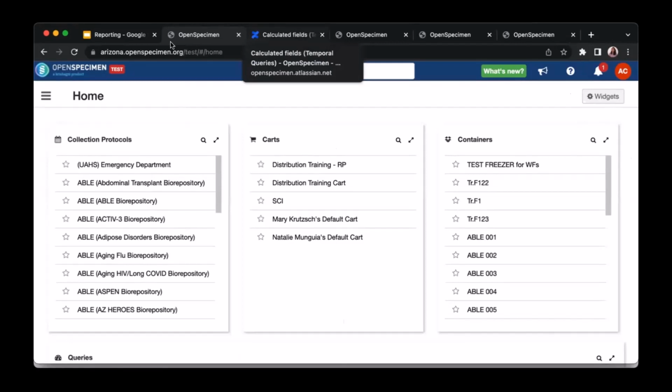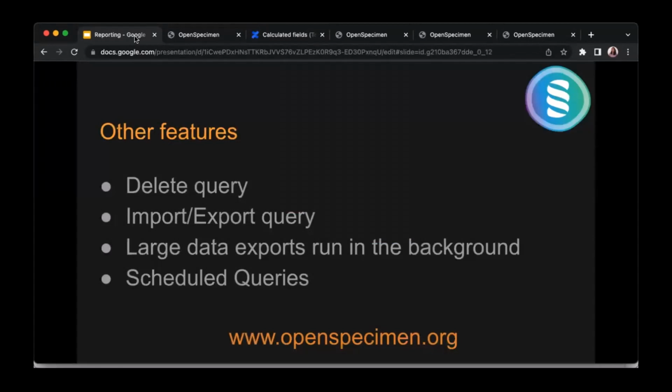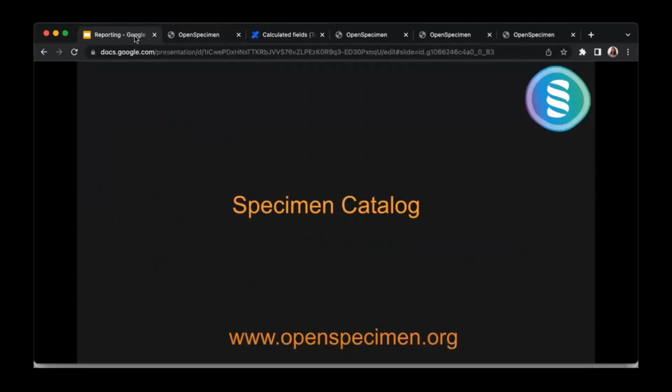Okay, so we just have 10 minutes left to finish today's session. Do you want me to continue with the catalog? Yeah, the invite is for another 40 minutes, so I think we can continue. Okay.